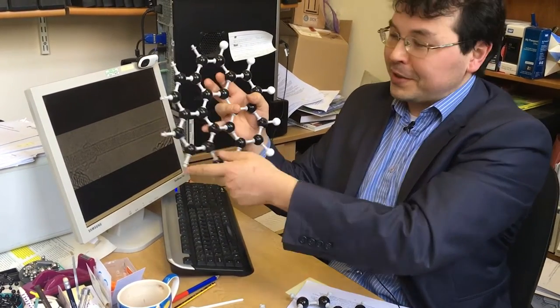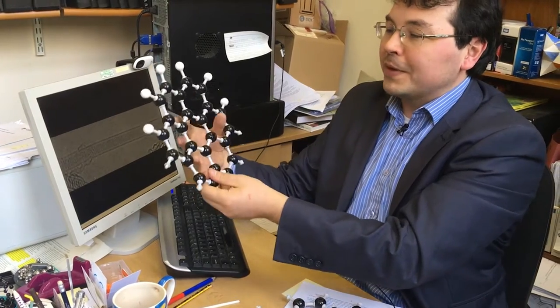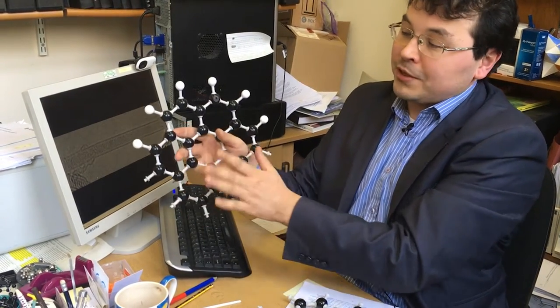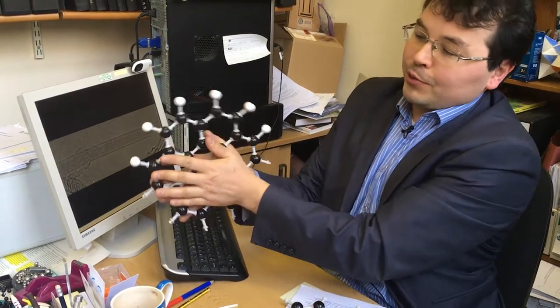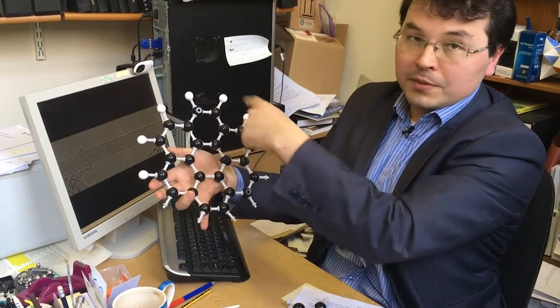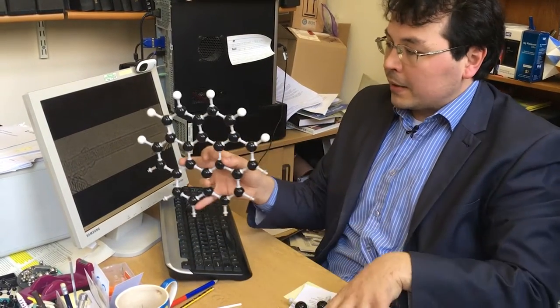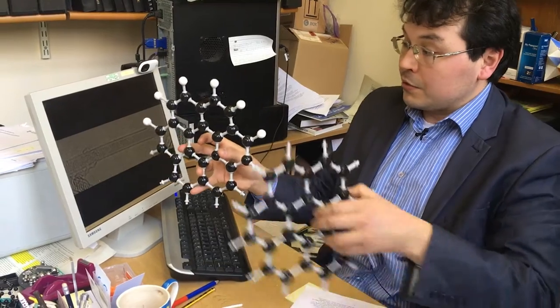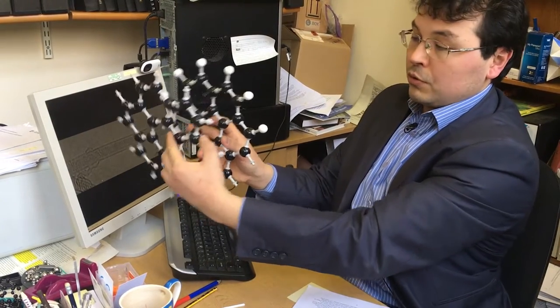But I run out of white atoms here, so you can see that this is just sort of open edge. Don't pay attention to that. Look at this one. That's what this molecule looks like. It's got 12 chlorine atoms around the carbon. I have about 50 molecules like this in the nanotube. We're looking at them edge-on.